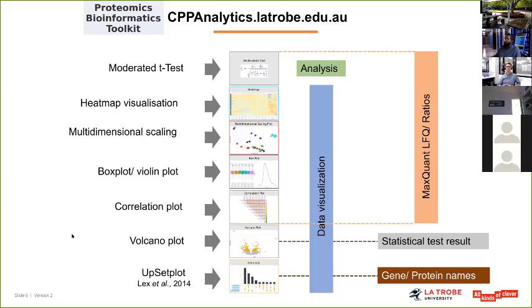And the upset plot is also the same. I'm not sure how many of you are aware of this, but this is a different type of representation of sets. Let me see if I can draw something here. So you have sets like that. Once Venn diagrams go above more than 5 samples, this is going to get very complicated. So to go around that, we use this upset plot.